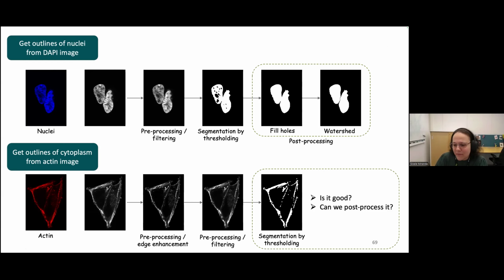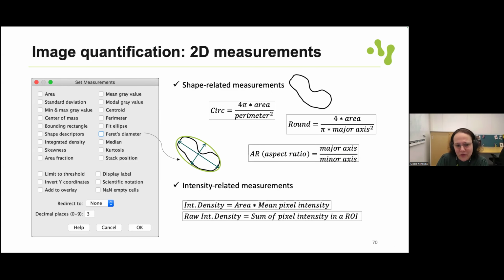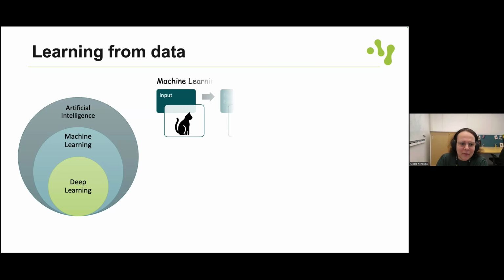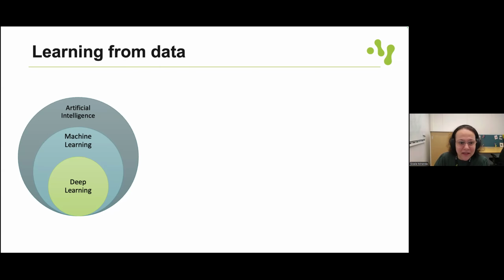Here we can use, for instance, other methods or AI-based methods that perform better than thresholding. And then, of course, once we have masks of our objects of interest, we can calculate the measurements. But with this last module, I just wanted to give an overview of what you can do with more advanced methods in the case when you couldn't obtain a very good segmentation of the cell.